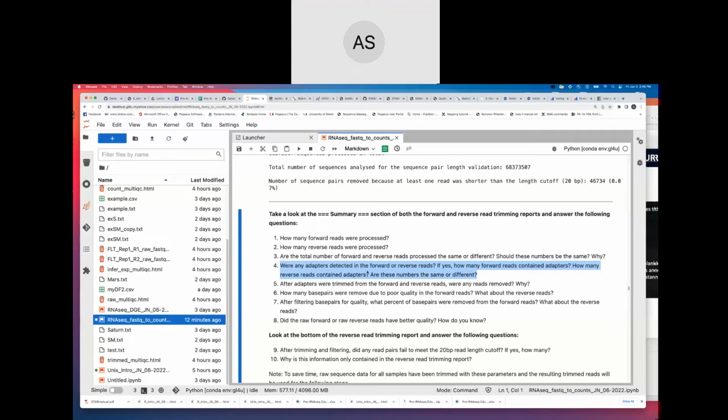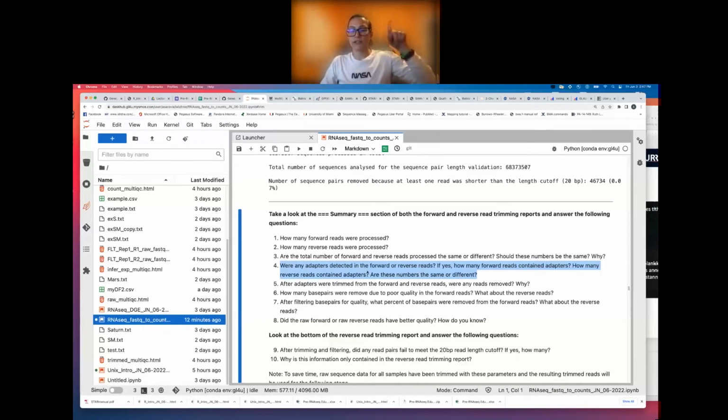Okay, so I'll give you 2 minutes. After you submit your first answer, go to the next question and submit your answer for that one, and I'll give you 2 minutes, unless, of course, you all answer more quickly. It's going to encourage you to look at the summary section of both the forward and reverse trimming reports, and it should tell you very clearly if adapters were detected, and if so, how many.